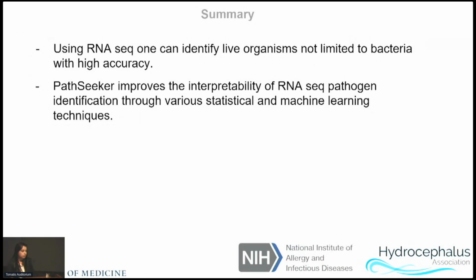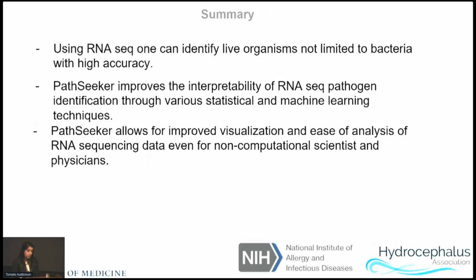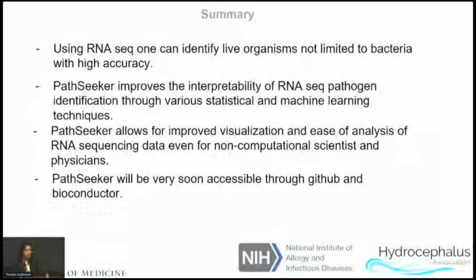organisms. Finally, just quickly, RNA-seq can be used to identify live and active infections, and this package uses various forms of statistical and machine learning methods, and it's easy to use, so clinicians can also use it. And hopefully, I hope by tonight or tomorrow, I'll submit it to Bioconductor. Thank you.